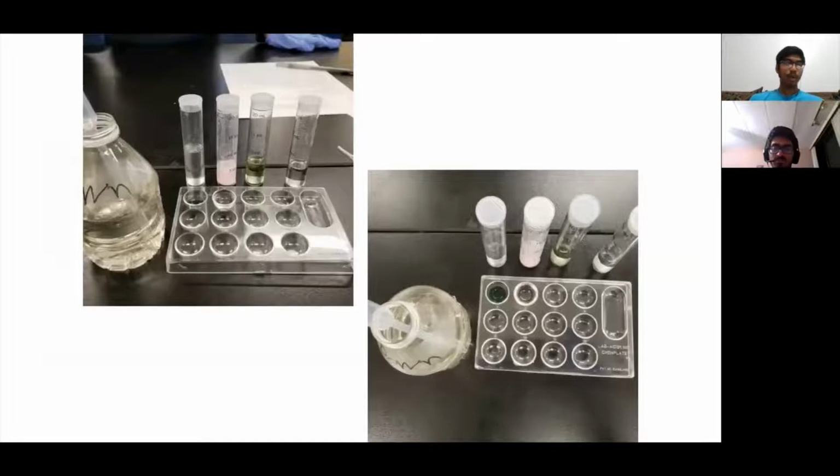And these are the water samples from downstream. In the downstream sample, we saw that the pH was higher as the color was darker. We see that there's a blue color in the template. However, the chlorine and chromium tests were negative here as well, and the nitrate test was positive, but here we can see a darker pink color, which means that there were more nitrates present.